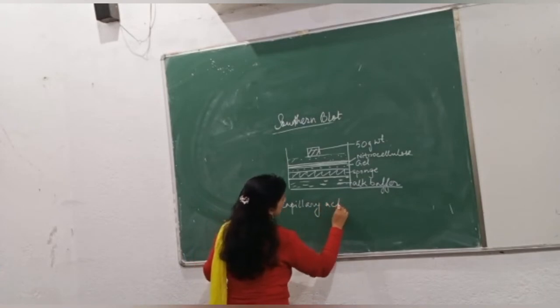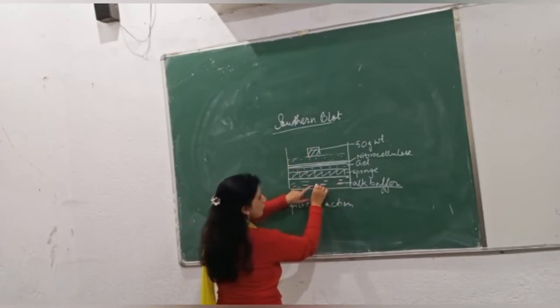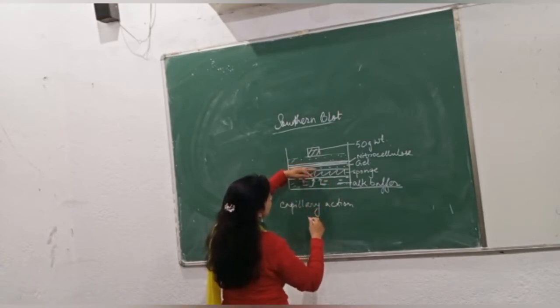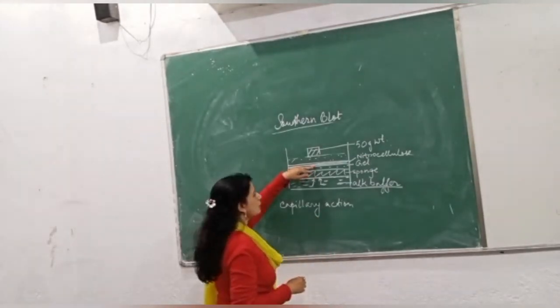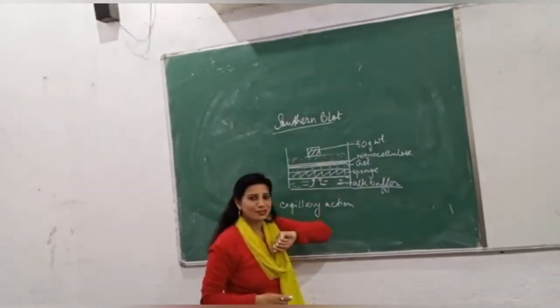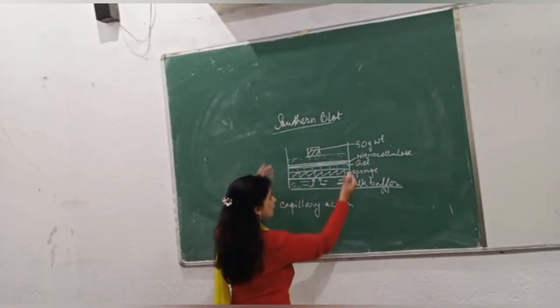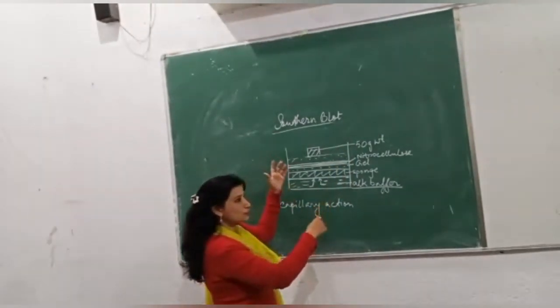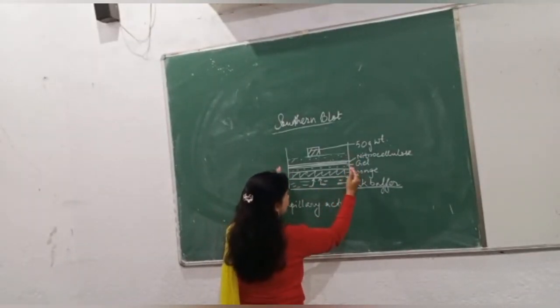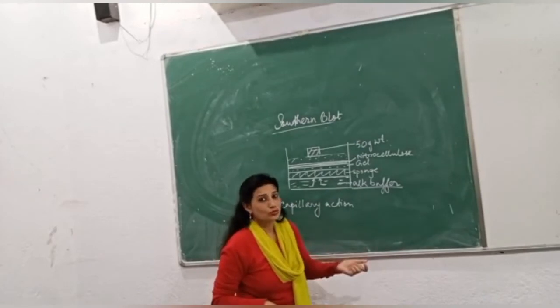Let's understand capillary action. What happens is, as I am putting the weight from the top region, in the alkaline buffer region, the buffer molecules will start moving up and penetrating through the sponge, and will enter the gel region. Again penetrating through the gel layer, it will enter the nitrocellulose layer, and finally it will come. Then what am I speaking about? Along with the buffer molecules, my DNA, which I will be loading here, as in gel electrophoresis, where I was loading it in agarose. Similarly, here, after preparing the whole setup, I will load my DNA into it, which will have my target sequence in it, which I do not know where it is present.